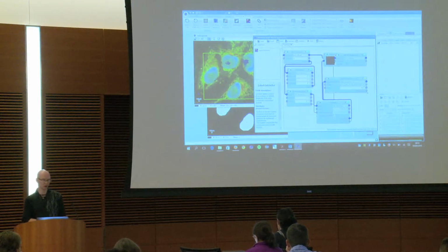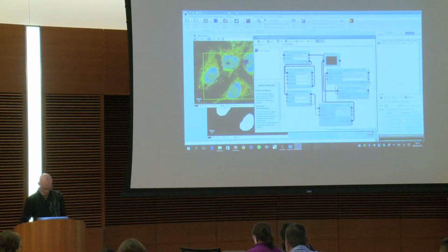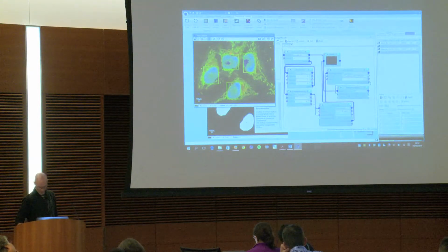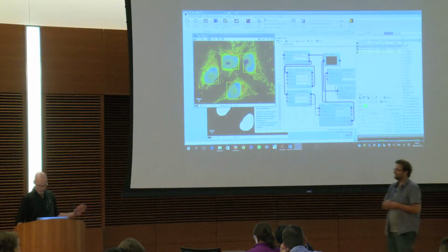So the difference will be that it will separate the ROI, it will separate the different objects. So I take the ROI and I connect it to my add ROI to sequence block. Okay, so this time, if everything is correct, you should attempt this. And this time, it's a lot better because in the ROI panel here, you have directly the information about the different objects. Still, that is not perfect.